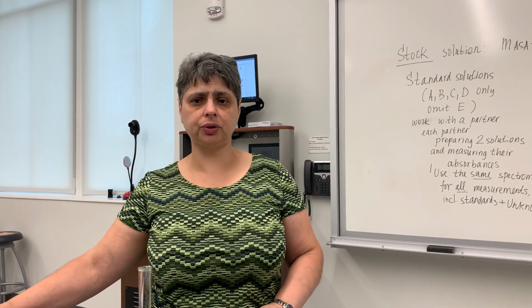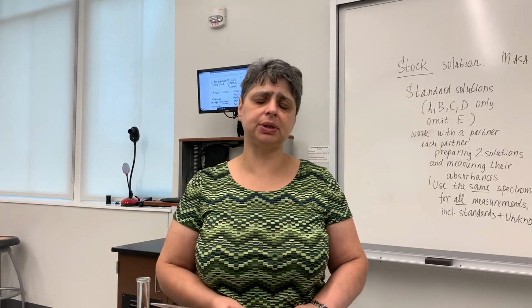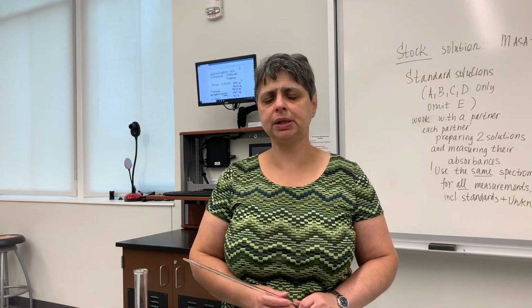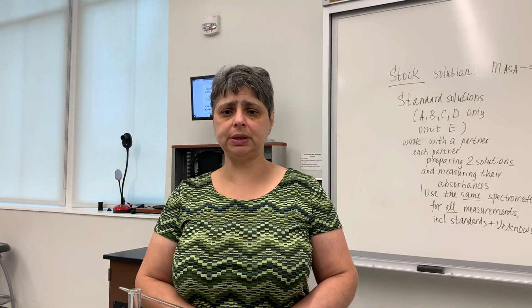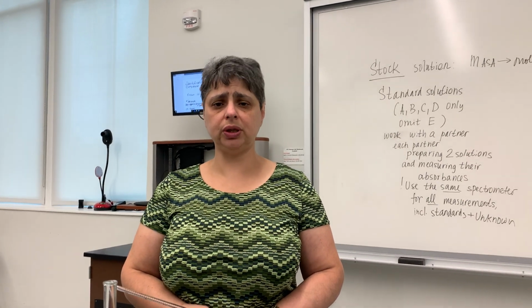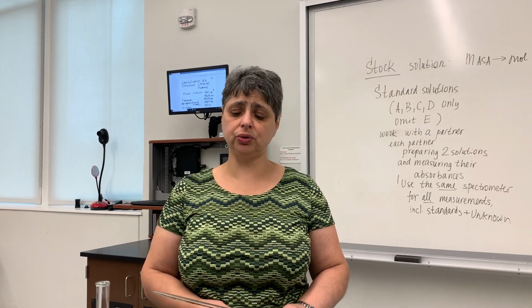So you'll take a tablet, a whole tablet without crushing or breaking it. You'll weigh it. It's fine if it's more than 0.4 grams. Some medicines' tablets weigh more than 0.4 grams. You're going to weigh a tablet. You're going to place the whole tablet in the Erlenmeyer flask. You're going to add sodium hydroxide. You're going to heat, and then you're going to make the same series of dilutions.